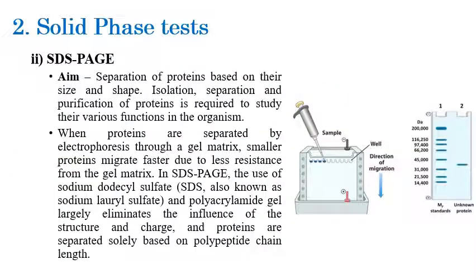The next technique is SDS-PAGE, sodium dodecyl sulfate polyacrylamide gel electrophoresis. It is a type of polyacrylamide gel electrophoresis, that is, SDS-PAGE is a type of PAGE technique. The main aim of SDS-PAGE is separation of proteins based on size and shape.